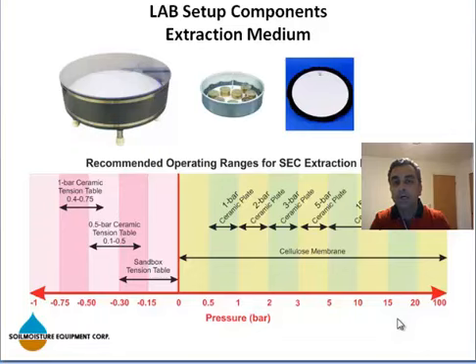1 bar high flow has been invented after 1 bar standard flow, and that is why it is better. It has more flow rate, and that is why we have 2 types of ceramics. Maybe we should have obsolete 1 bar standard flow, but because it has been in numerous publications and other scientific sources, people still are asking for it, and that's why we are still making them.